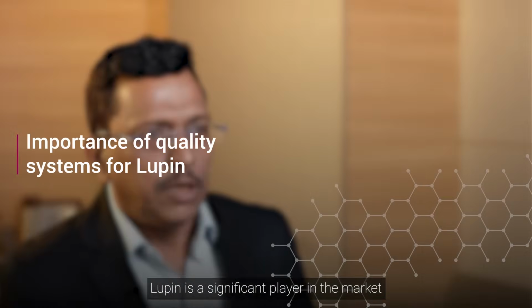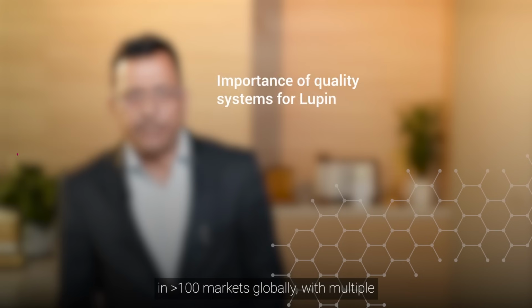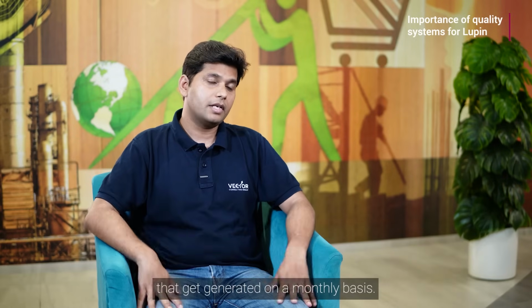Lupin is a significant player in the market. We have a presence in more than 100 markets globally with multiple manufacturing sites and research facilities. So in pharma labs, one of the key parameters which gets evaluated is the quantum of invalid OOS and lab incidents that get generated on a monthly basis.